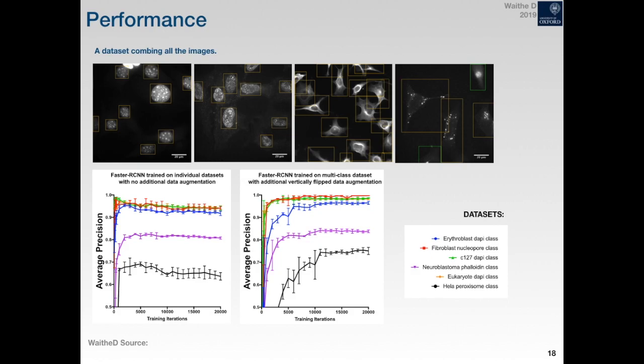And also, what I find is if you train your algorithm to recognize cells across multiple data sets, it will perform better than if you just train it for one specific data set. So what we're doing here is we're creating a corpus of data from which it can try and recognize the cells, and it will do a better job if you set it the challenge of learning cells across multiple data sets simultaneously and then evaluate it on one of those data sets.